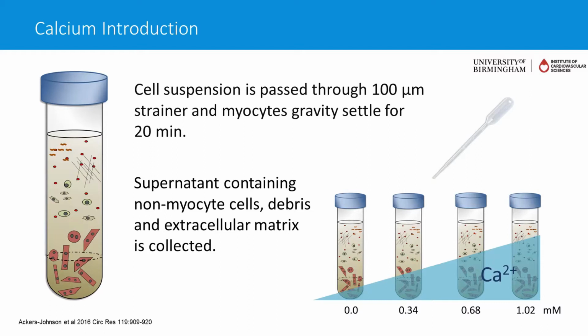They're quite nice because they're effectively vertical all the way down, and then they have a round bottom without a gradual rim, so all of your cells collect right at the bottom, but not in such a big pellet with a potentially hypoxic core. It's more gradual all around the bottom of the tube, and they're also much cheaper.